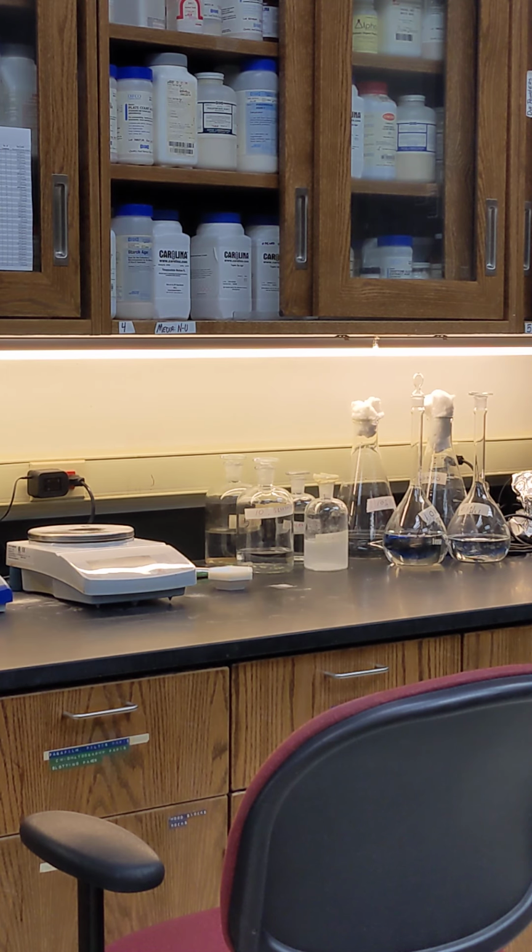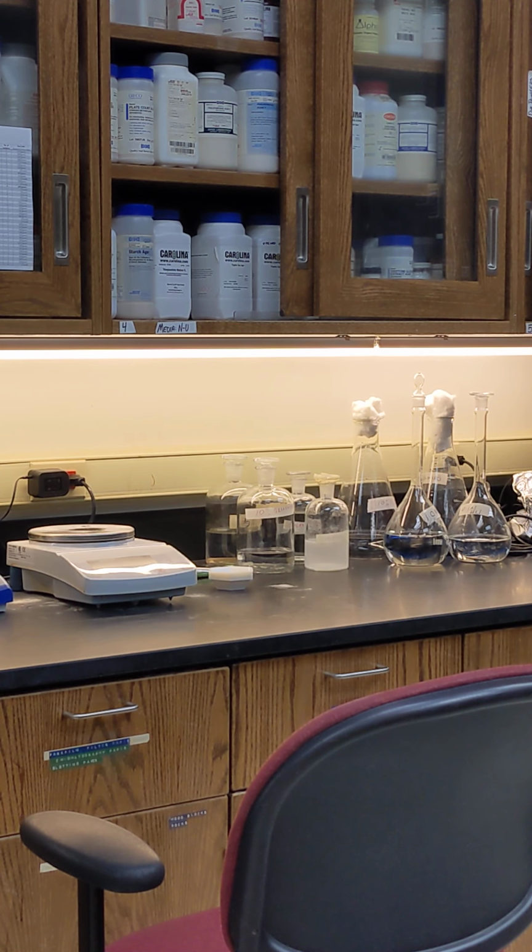So the first thing we want to talk about briefly is what is media? Media is going to be this material that we use to culture our microorganisms. It can be liquid, it can be solid. It can grow a whole wide range of different microbes, or it can be very selective or differential for just certain microbes. The one that I'm going to work on today is something called tryptic soy agar.